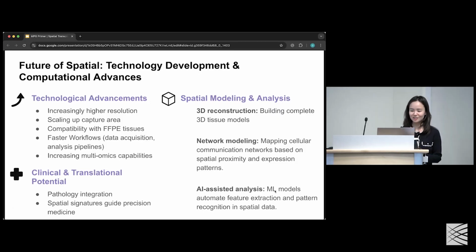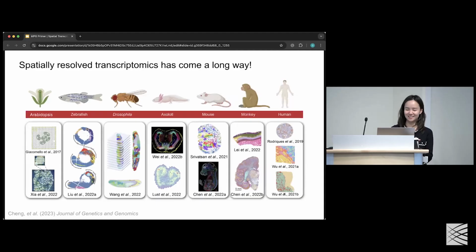And if you can use machine learning models to do feature extraction from images, or just pattern recognition in spatial data, perhaps there will come a day when we have outputted enough really high quality data sets that we will be able to just image a cell and potentially infer its transcriptomic state. That is probably a slightly longer term, perhaps not so long because AI is crazy. But that is what I think are exciting future directions.